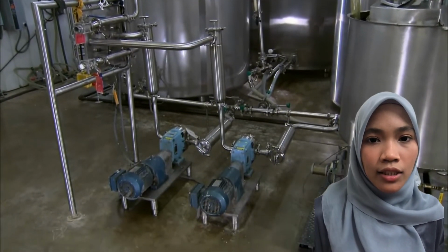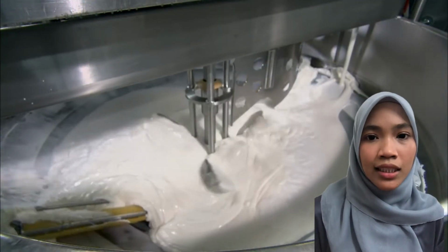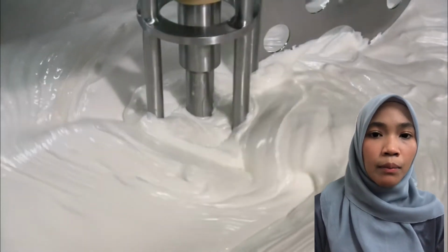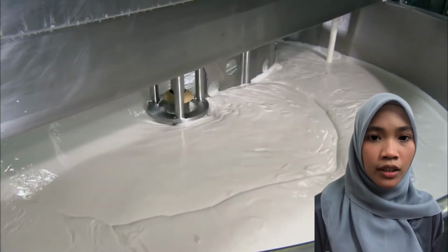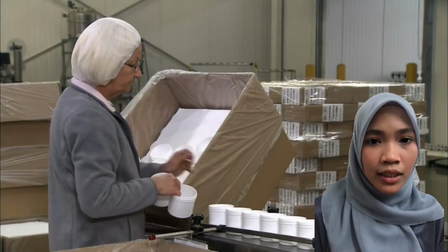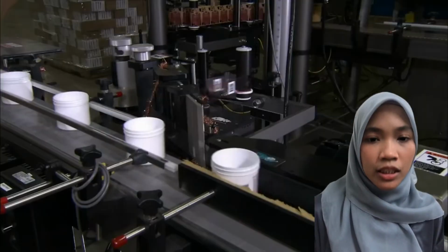Natural product extracts often consist of hundreds of compounds, and you often need to isolate a single compound of interest from the mixture. Most commonly, we perform the initial isolation by flash chromatography to pre-fractionate and reduce the number of components in the mixture. Then we follow up with a final purification by prep HPLC.